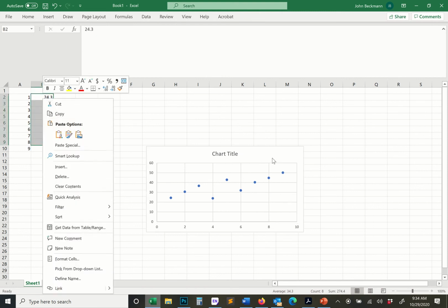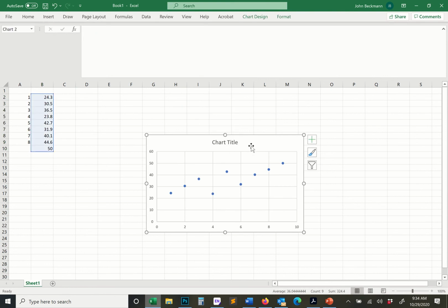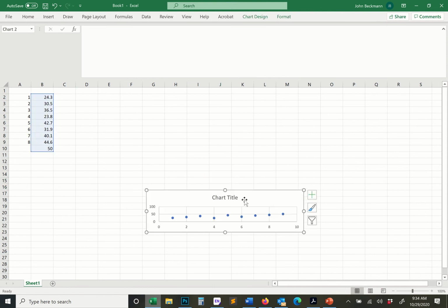Let me quickly show you how to do this. Usually I'll include a random extra value, like a 50 that is not actually a sample, to standardize the axes. Then let's insert a scatter plot, which is very quick and easy. Now I'm going to shrink the scatter plot so that the y-axis ticks are 50 and 100.